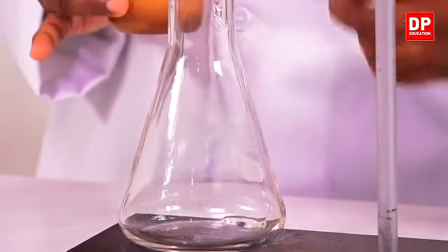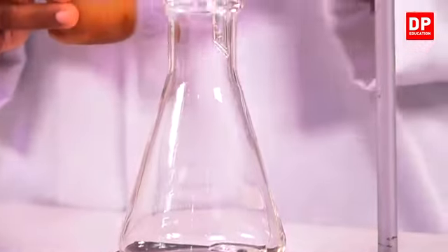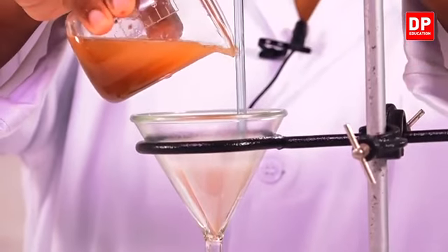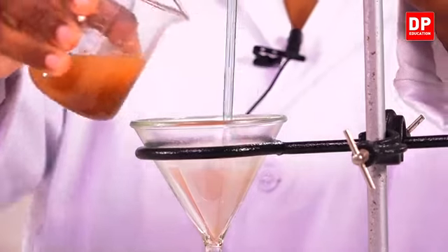Now here you can see the clear solution getting filtered. So when the amount of solution inside the funnel decreases, we transfer more solution.